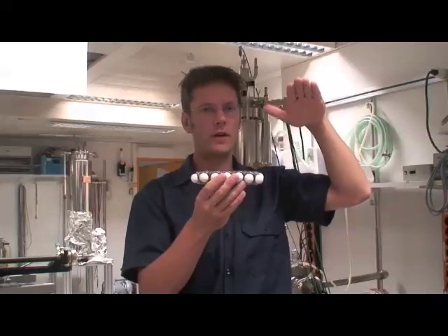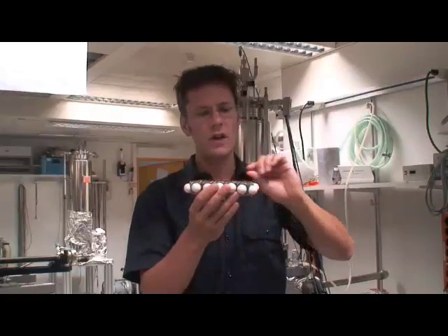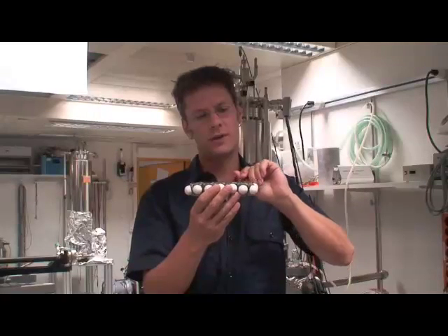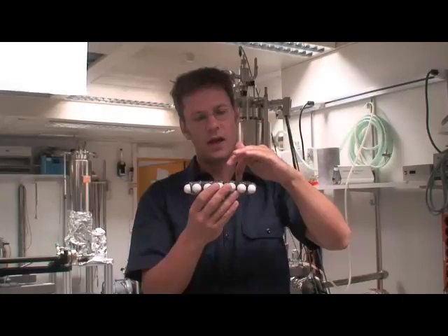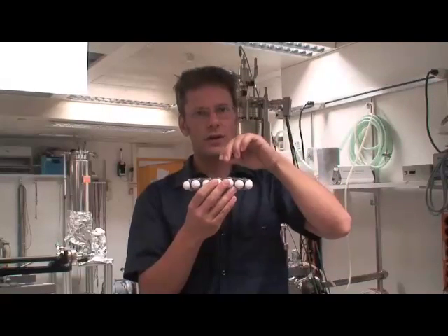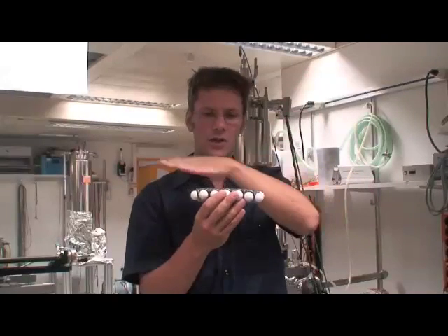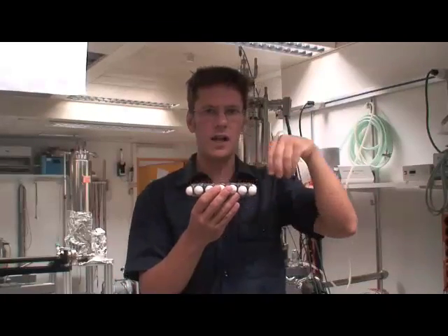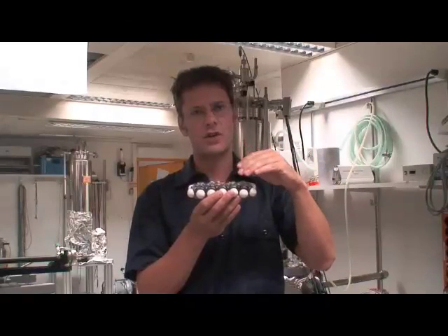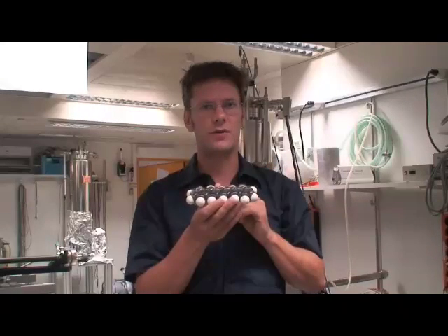And only when we go very close, we see on top of this attractive potential a smaller repulsive force. And this is due to the Pauli exclusion principle. This happens when the electron orbitals of the CO tip and the Pentacene molecule start to overlap. And then we get this Pauli repulsion. So we have this large attractive force that also gives us the dark halo surrounding the molecule. And on top we then get this tiny corrugation which tells us the atomic positions and also the bond between the carbon and hydrogen atoms."